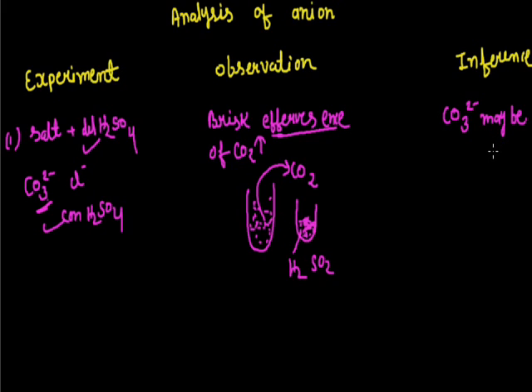Now it is only a maybe. Next, how can we confirm that the salt definitely, 101%, contains carbonate? So we take a confirmation test.